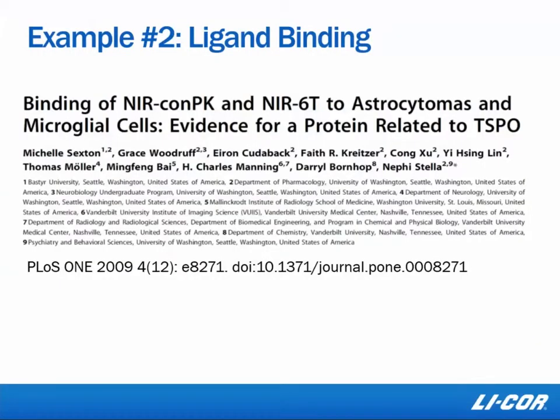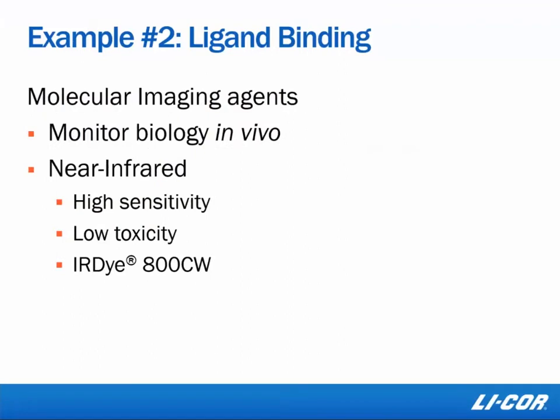This work is from Sexton et al., published in 2009 from PLOS One. Now, this research group wanted to develop a molecular imaging agent for use in vivo. And they wanted to utilize the near-infrared wavelengths to accomplish this. And so the question is, why near-infrared?